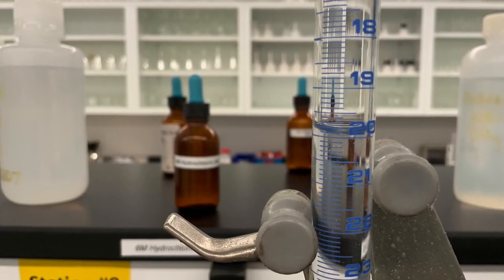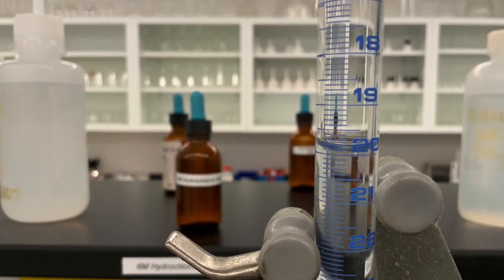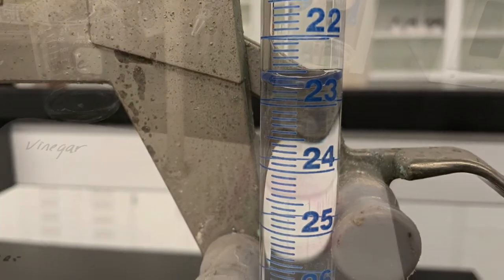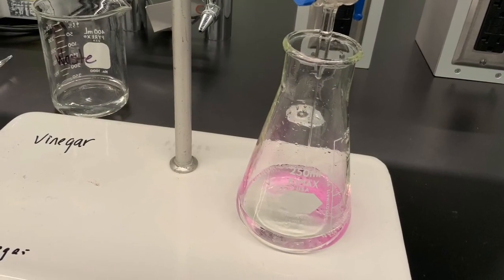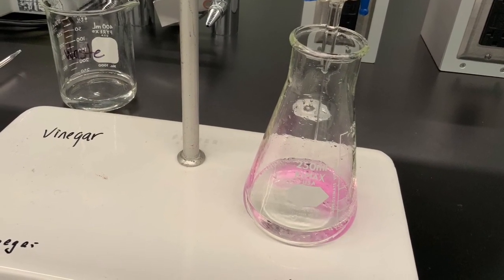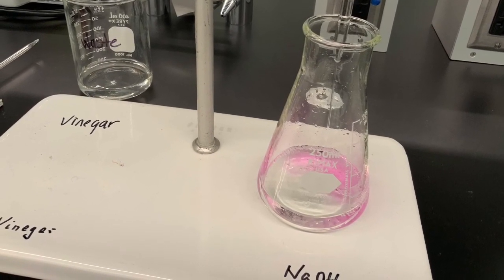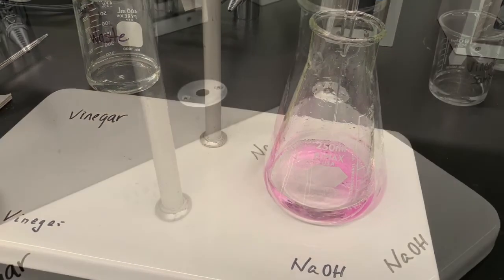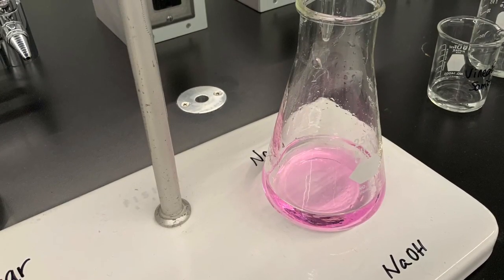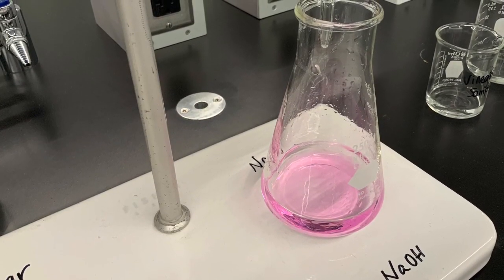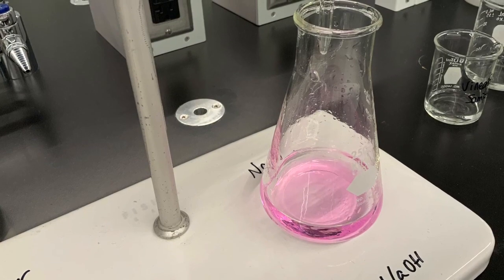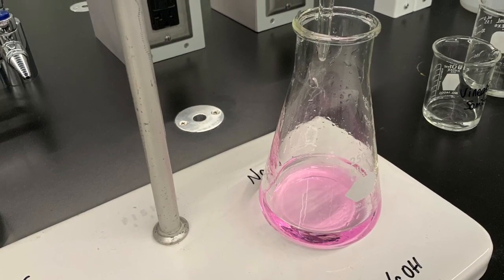As you add more and more sodium hydroxide solution, it will take longer and longer for the pink color to disappear when you swirl. And ultimately it's just one drop that makes the difference and the pink coloration does not disappear anymore. This is when you have equivalent amounts of acid and base in your Erlenmeyer flask.